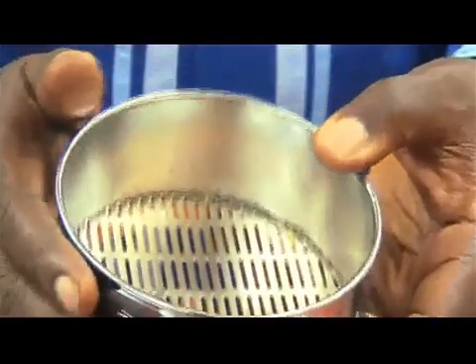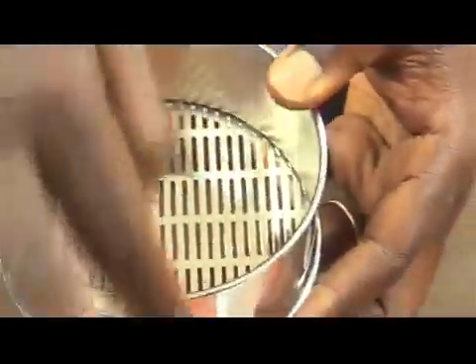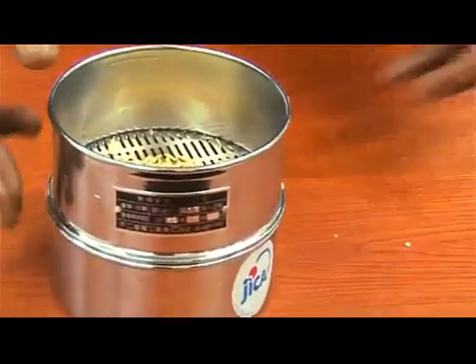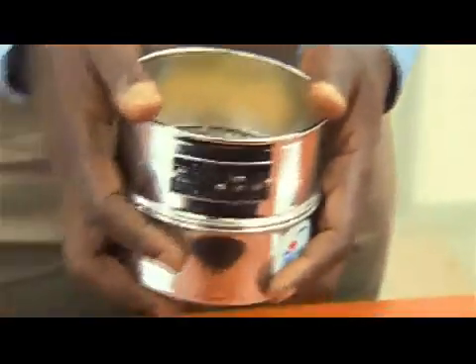Sieving. Sieve the 20-gram paddy sample for 30 seconds using a 1.7 mm sieve. Anything that passes through the sieve is categorized as foreign matter. Be sure to shake along the paddy-shaped long openings.